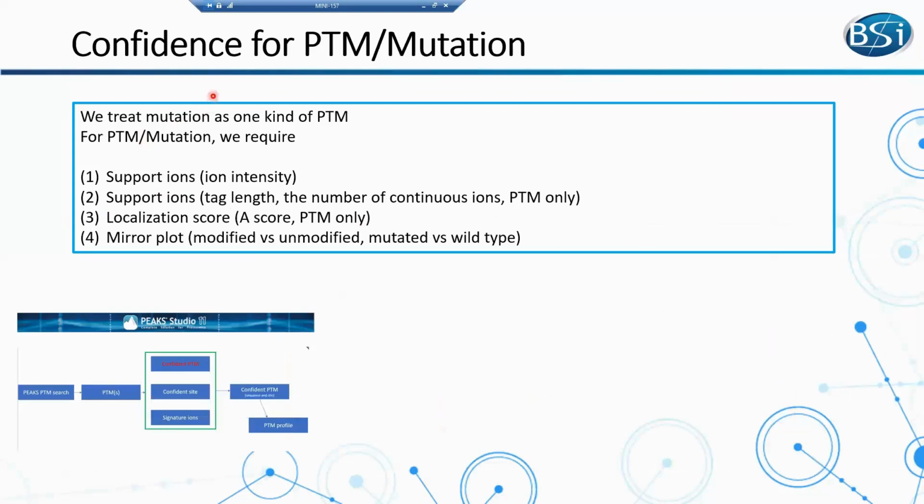Okay, then we can talk about our workflow and our result node or the page layout. In the previous slide we showed how we can say that the PSM itself is confident. And now we talk about how we say that the PTM and the mutation are confident. Basically, the idea is the same as the PSM, but for the PTM and the mutation, there are some additional requirements.